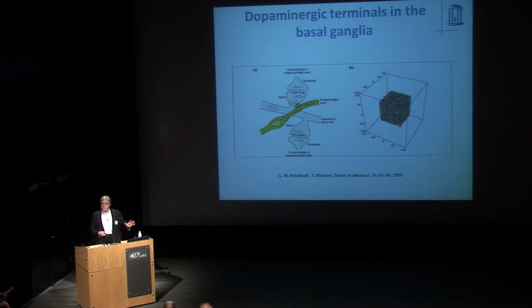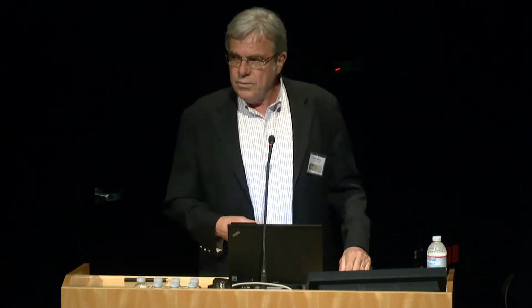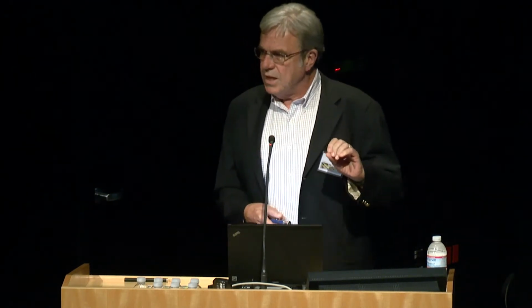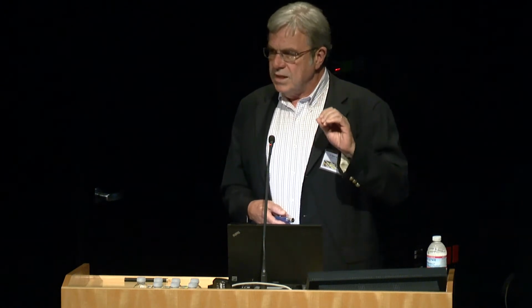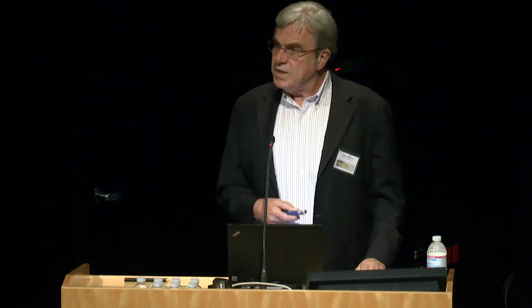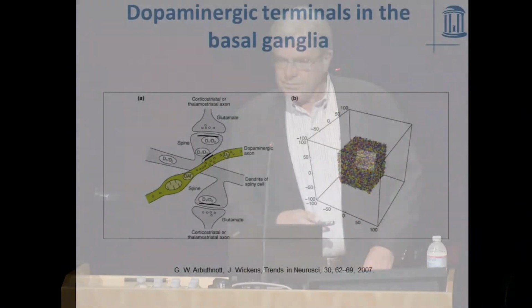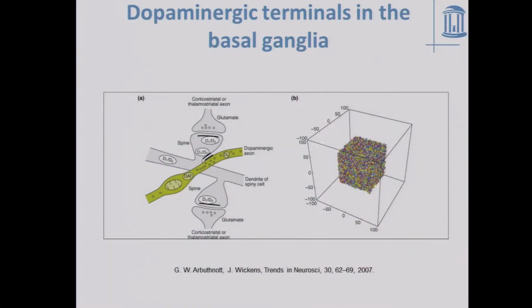So we want to be able to see dopamine release and understand what caused its release, of course, and be sure that we know that we're looking at dopamine and not some other molecule. But we also want to understand these receptor interactions, and we want to understand the firing rate changes that occur in the neurons, because that's the way information is processed in the brain. The slide that I'm showing you comes actually from Jeff Wickens' lab, and he was trying to illustrate the complexity of this task of looking at neurotransmitters.